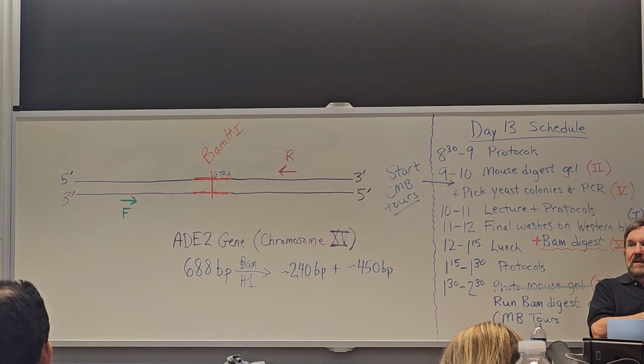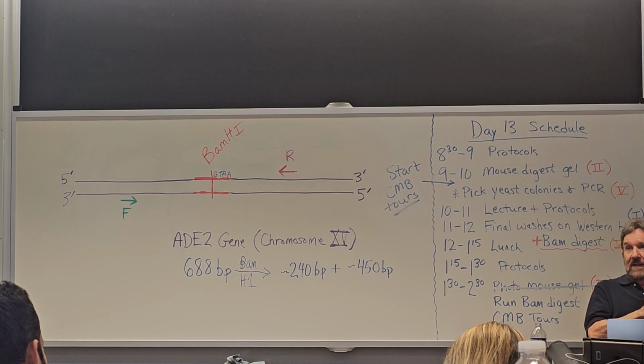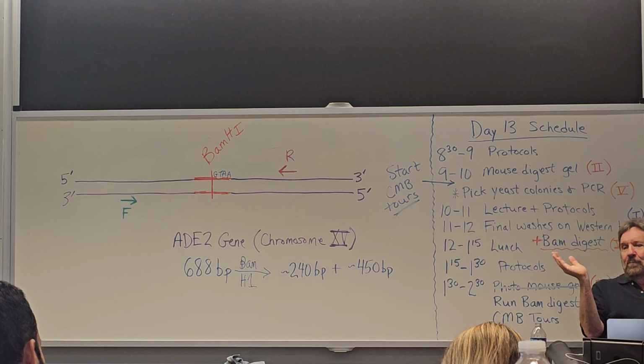What we find in our yeast experiments when we've done this in the past is that we get about 10%. So we expect about 1 out of every 10. So if each group picked 2, that's another 32 that we picked. So we might get another 3 or 4 that way. See how it comes out.